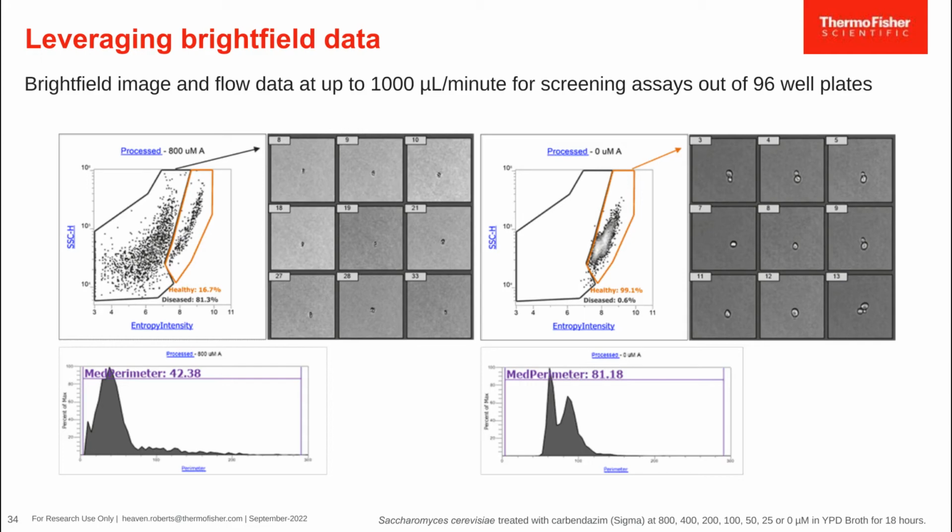Unfortunately, because these picked up every stain I threw at them, they made the staining profile on this nearly impossible. And so it was much easier and frankly much more robust to use these extracted parameters in combination with my flow parameters because of the altered staining profile of these diseased events.